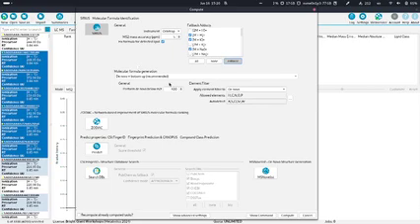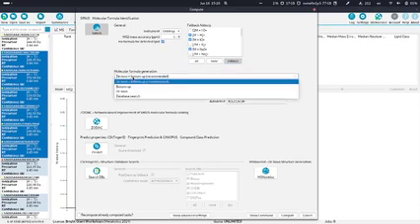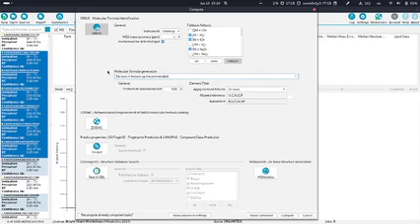Okay. So the next setting I want to show, and this is also new in SIRIUS 6, is that there are now multiple options to do the molecular formula generation. You can do it either completely de novo, which you will now have to select from this drop-down menu, which can be computationally intensive, especially for very large compounds. But now in SIRIUS 6, there's also the option to do a bottom-up search, which Kai's already talked about. And it is usually really fast.